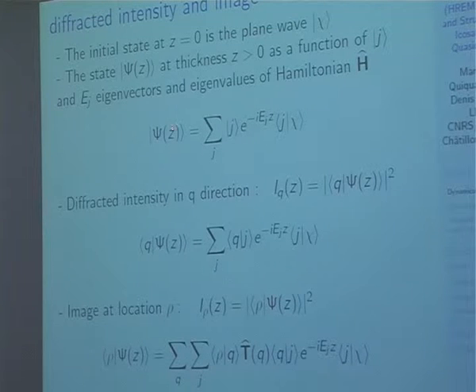When you project this state on the Q vector that is located in the diffraction, the reciprocal space, you obtain the diffracted intensity here, that comes from this expression.